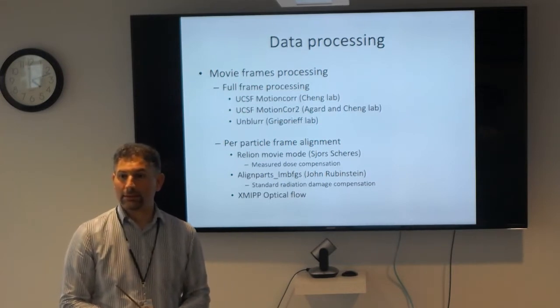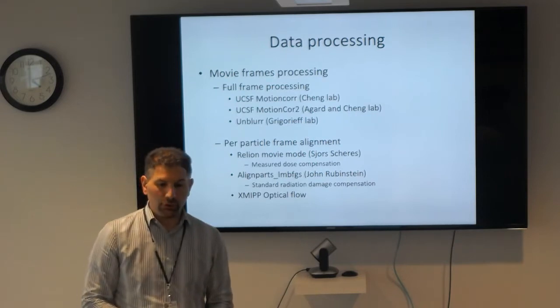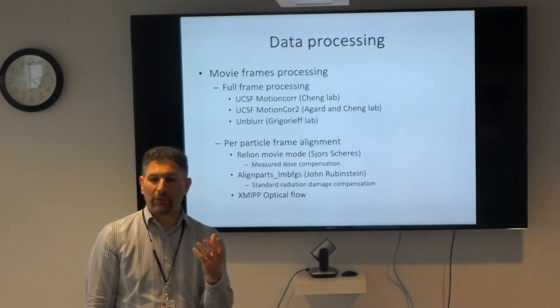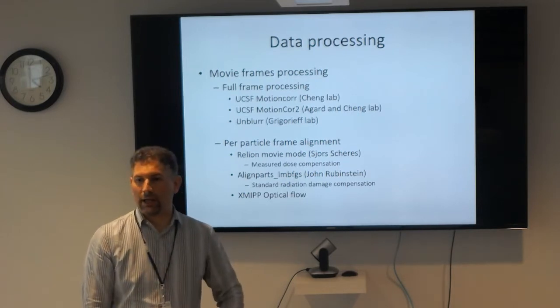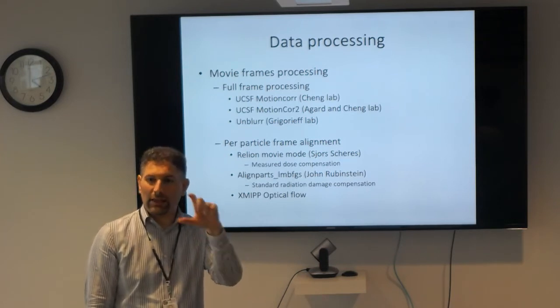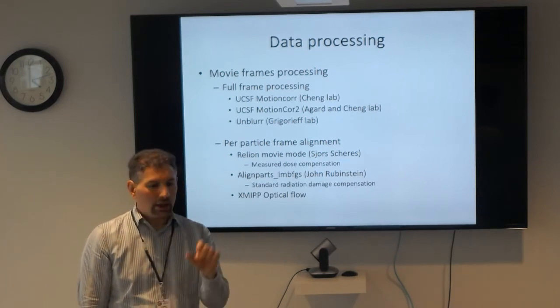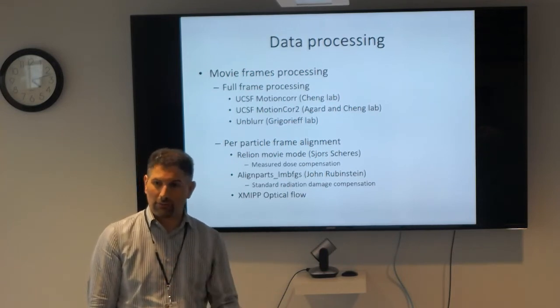Yes. Can you predict which 3D class will have higher resolution than the other? If you're lucky, one class will have significantly more particles than the other. For example, if you're using Relion and you look at the model.star file, it's got the frequency, the resolution, all the things. You might see one class that has a lot more, and if you look at the reconstructions, you'll see it actually goes to a higher resolution. You'll see a lot more features. That's the easiest case scenario.